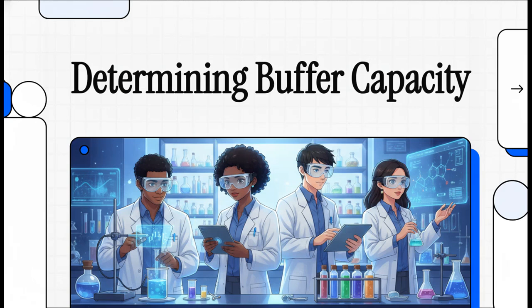I am seriously thrilled to have you here for today's explainer because we're going to dive into a truly immersive laboratory experiment on determining buffer capacity. We're going to put on our virtual lab coats and walk through the exact step-by-step process required to test and measure a buffer's limits. This experiment is an absolute cornerstone in analytical chemistry, biochemistry, pharmaceutical sciences, environmental analysis, the whole shebang. In all of these fields, maintaining a stable pH isn't just some nice-to-have bonus, it is absolutely essential.